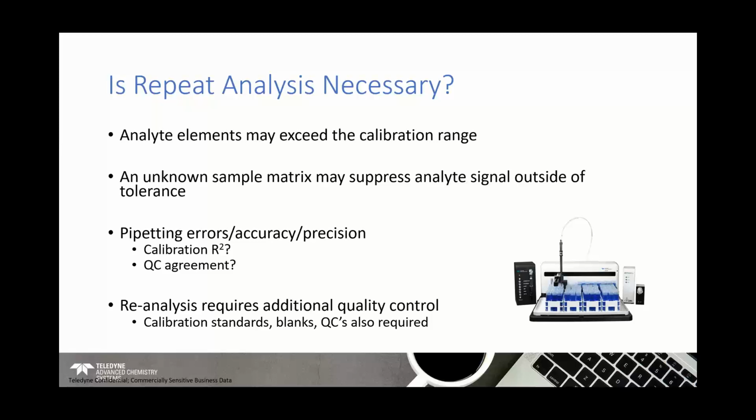And then, as I've mentioned as well, reanalysis of samples, even if it's just a handful of samples from your analytical batch, is not just the analysis of those samples; it's another set of calibration standards, blanks, and QCs that require preparation as well. So that's where I want to leave that part of the discussion for a minute.